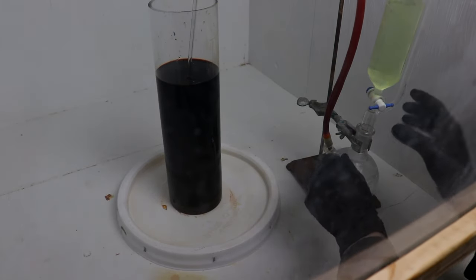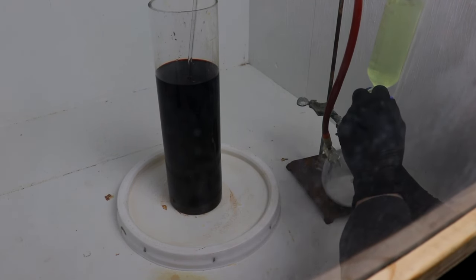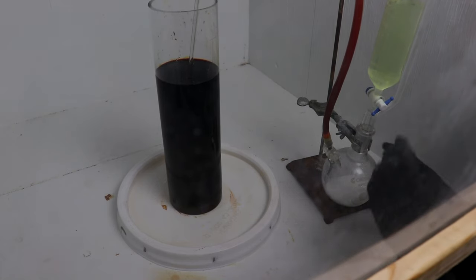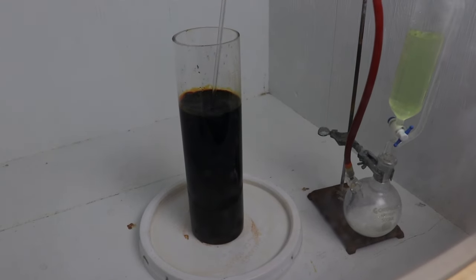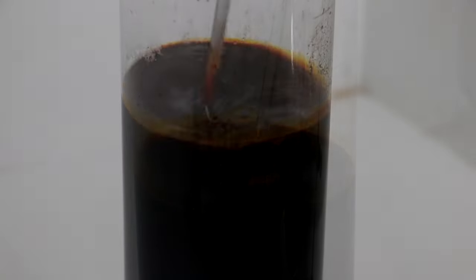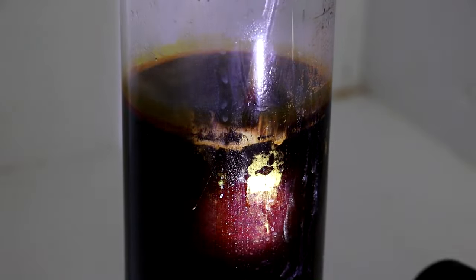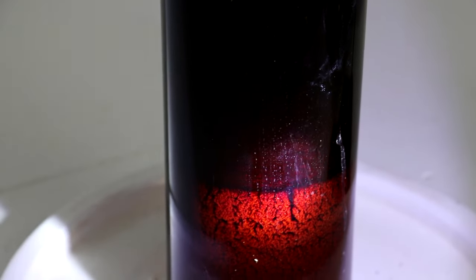From that to the bottom. Let's add in the sulfur dioxide. There we go. Go through a little at a time, and at some point we should see metallic gold forming. So here we are. You can see I've added a bunch of the gas. Well, you can see that there is a bunch of gold powder settling out of the solution. Still got a long ways to go, though.